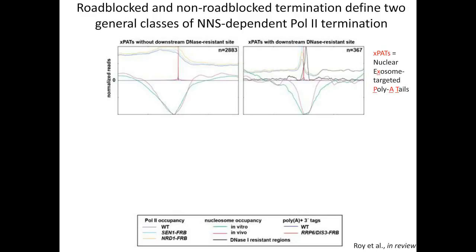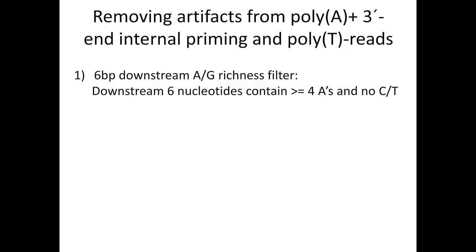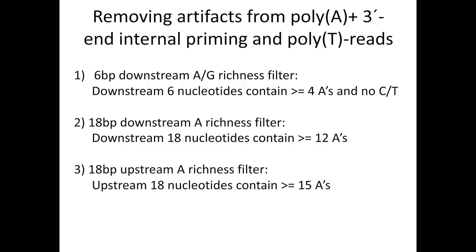I see. We have another question. How do you deal with internal priming? Internal priming. Perhaps later they can go through that section again in detail, but we dealt with internal priming first by raising the temperature of the reverse transcription to 42 degrees. That reduced but did not eliminate internal priming, and so we added the computational filter. Again, that's on slide 12 here, so I don't want to go over all that again, but we did these 3 steps to get rid of internal priming after the fact computationally.